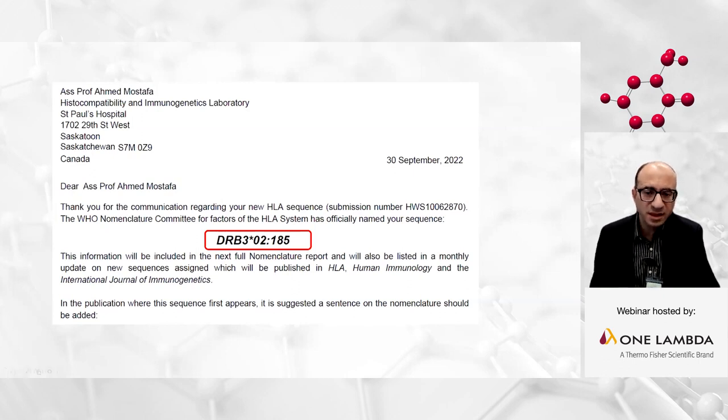And you can see that we got this letter on September 30, and we actually submitted this on September 9. Because everything was smooth, they didn't have to come back to us to ask a question. So the submission went very smoothly and quickly, in a couple of weeks.